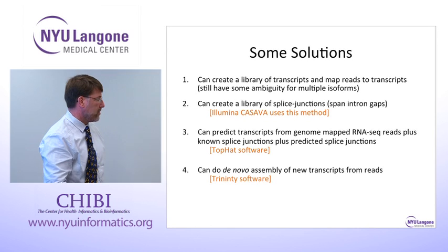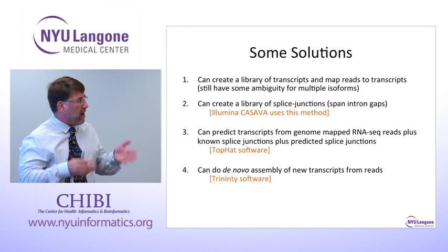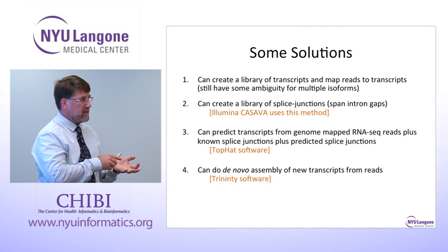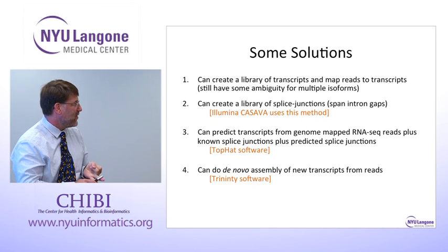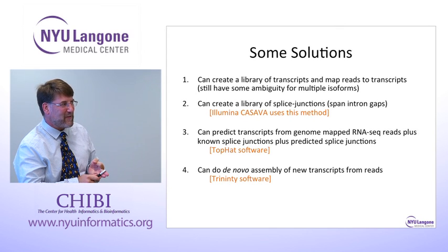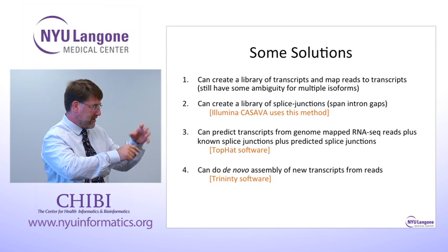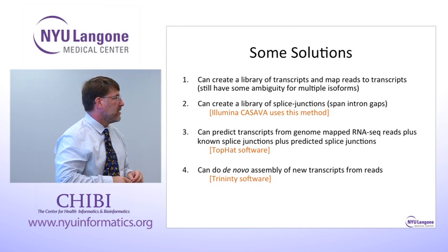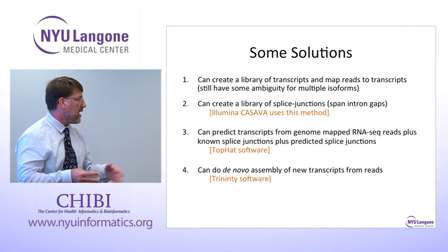So you always make the same size of reads? Yes. On an Illumina system, all the reads from one experiment are the same size. You can choose, actually, it's like a menu. You can choose 36 base reads, 50 base reads, 100 base reads. We sometimes get 75s, but not in the current batch of kits. There's a little kit that has a whole bunch of reagents, and that actually determines how many you're going to get. And how you choose that, there's, again, a whole lot of factors that come into play.